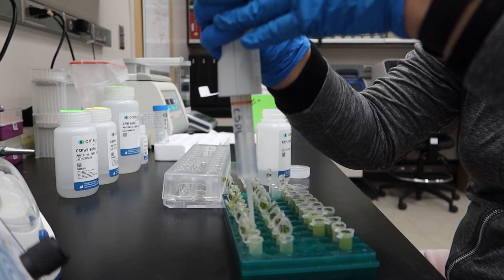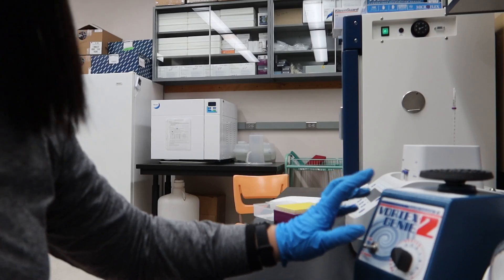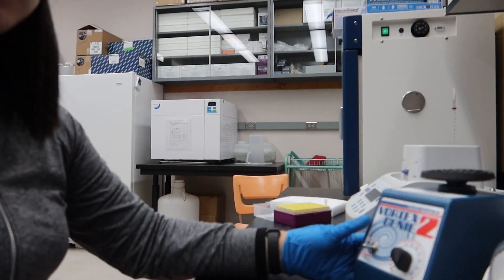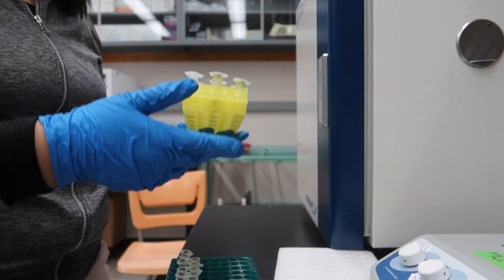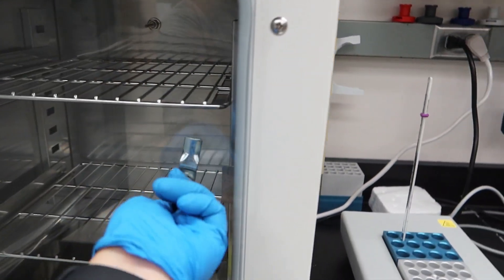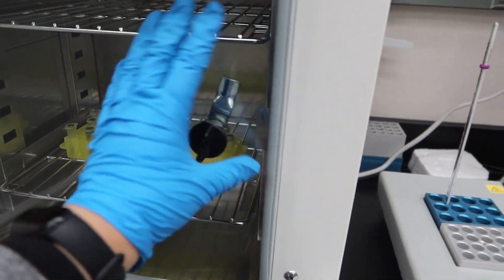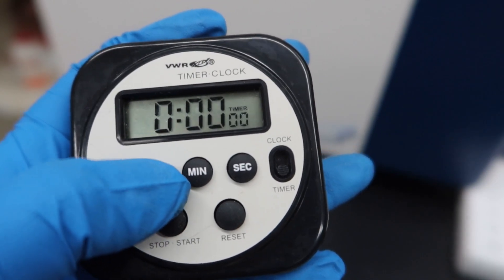One, two, three, four. So ito yung vortex — itouch mo lang siya, pwede ding i-on siya. Ganito siya. Set natin ng one hour.